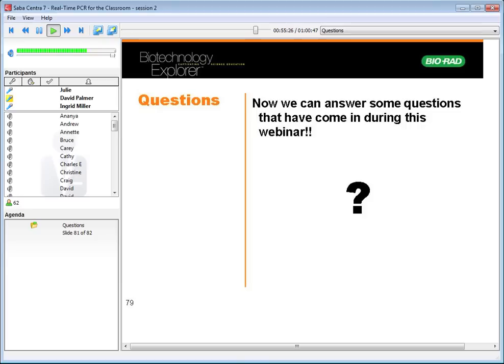Oh, okay. Someone asked, do we have a recommended site for purchasing primers? Right now, Bio-Rad doesn't sell or make primers, other than the ones that we supply in our kits already. So places that we recommend people to get primers from would be something like IDT Technologies or also BioSearch Technologies. Both of those companies do a really good job at developing and selling primers. Operon also does primers too.